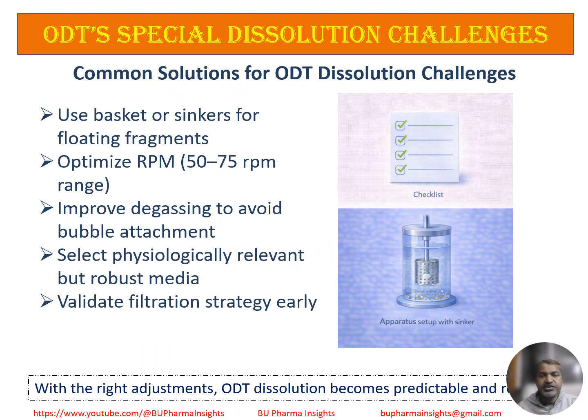Always follow a structured approach in method development. First, observe behavior. Watch the tablet or fragment in real time. Then adjust step by step. Use a basket or sinkers for floating fragments. Optimize RPM, 50 to 75 RPM.